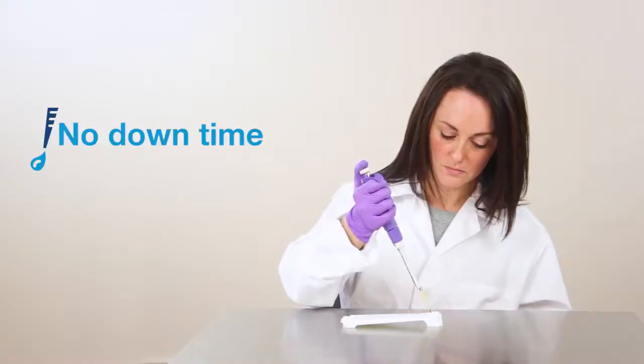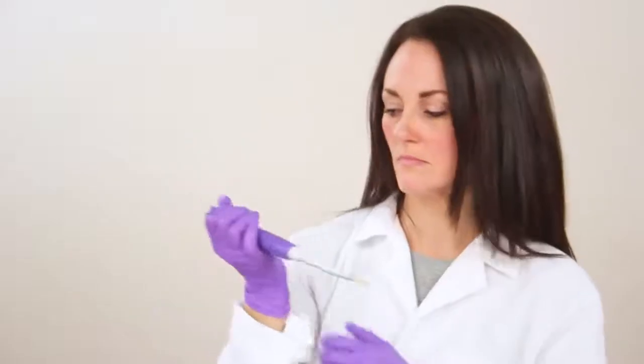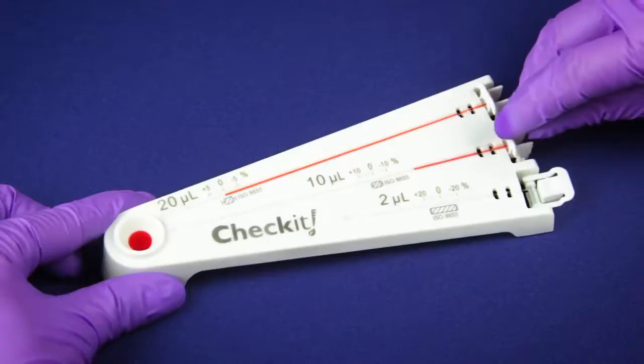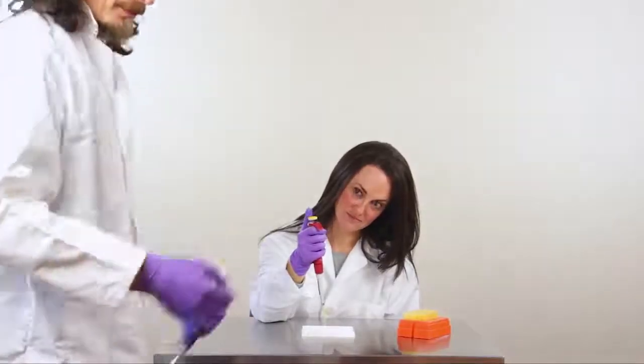The Check-It can save time and money on calibration services too. Best of all, you can do your experiments with confidence knowing that your pipettes are delivering accurate volumes. The Check-It is especially useful if your pipette has been dropped, cleaned, or borrowed.